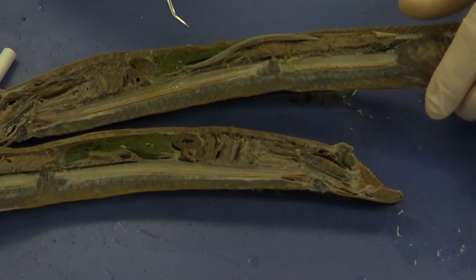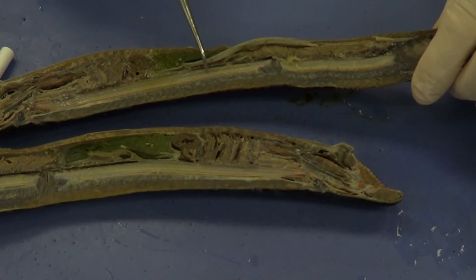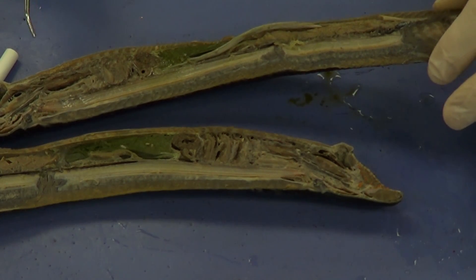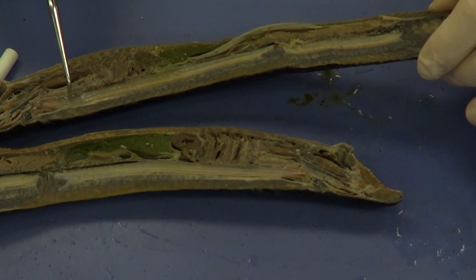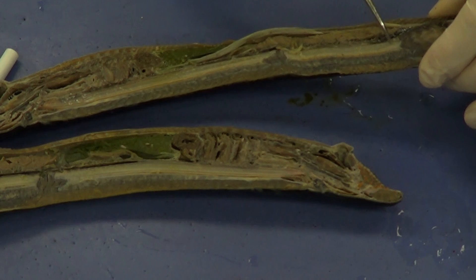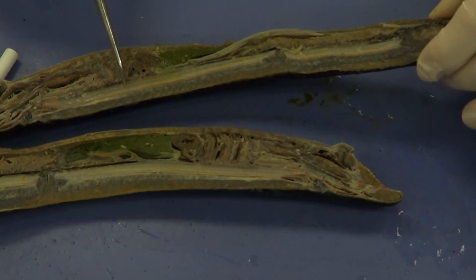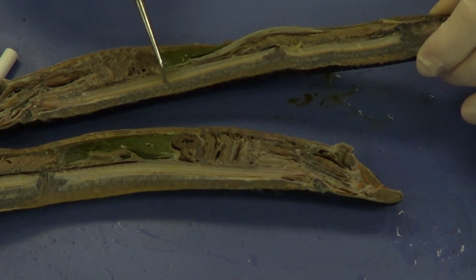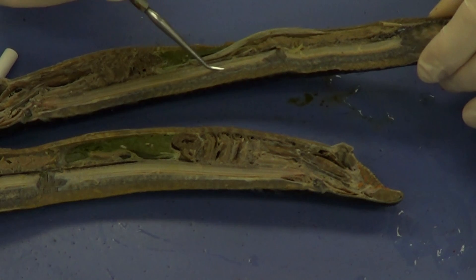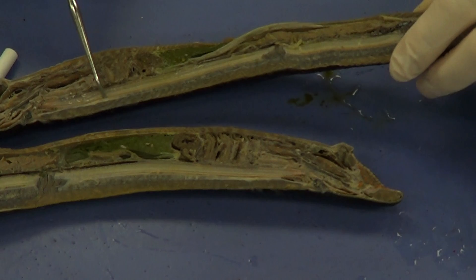We see a very noticeable structure right here — this is going to be the notochord, which this animal is actually named after. It belongs to the phylum Chordata, and this notochord is what chordates are actually named after. This is used for flexible support. Just dorsal to the notochord is the spinal cord, which in a very immature lamprey would have been the dorsal hollow nerve cord.